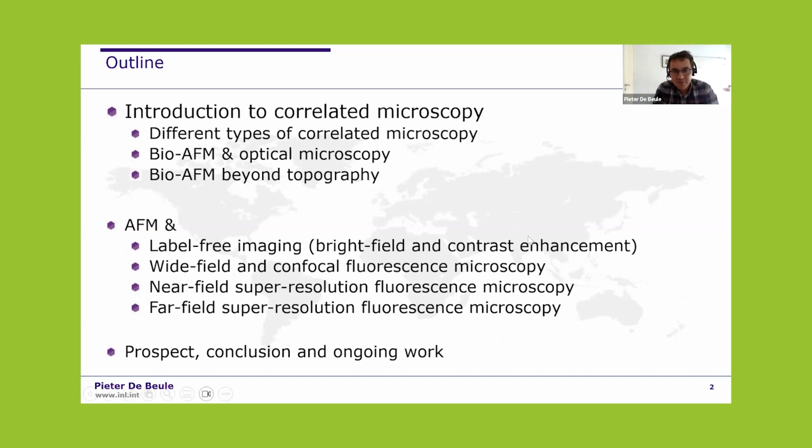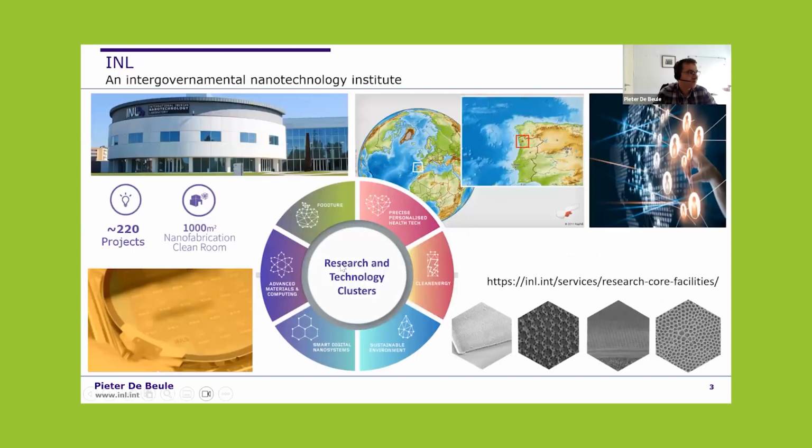And so I will give a bit of an overview today. I will talk a bit about the challenges. I will try to explain what are the challenges if you would like to make a setup like this in your lab, or even you would like to explore certain things, that there are limitations to certain aspects, and it was nice to be aware about it before engaging in this type of work.